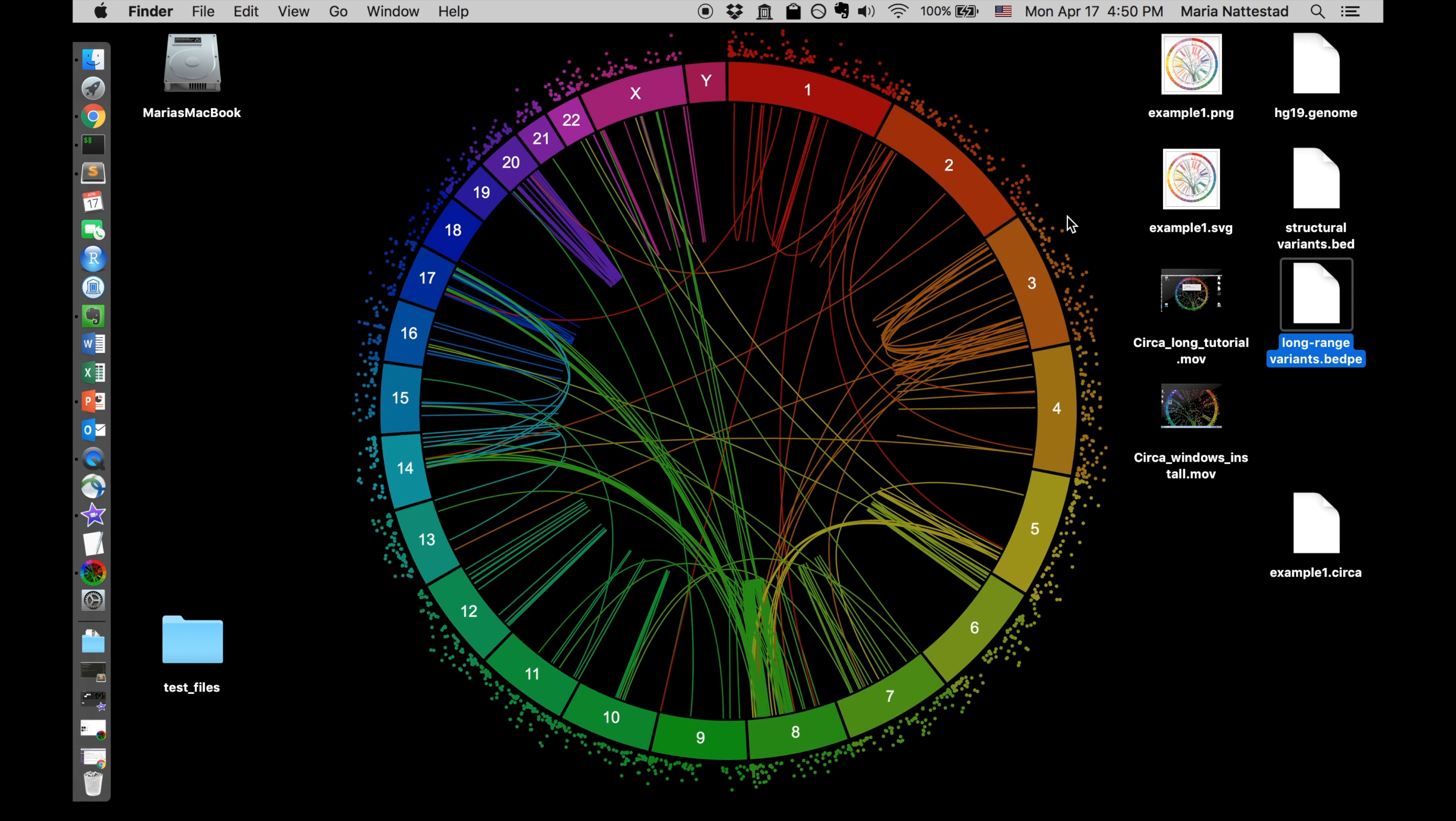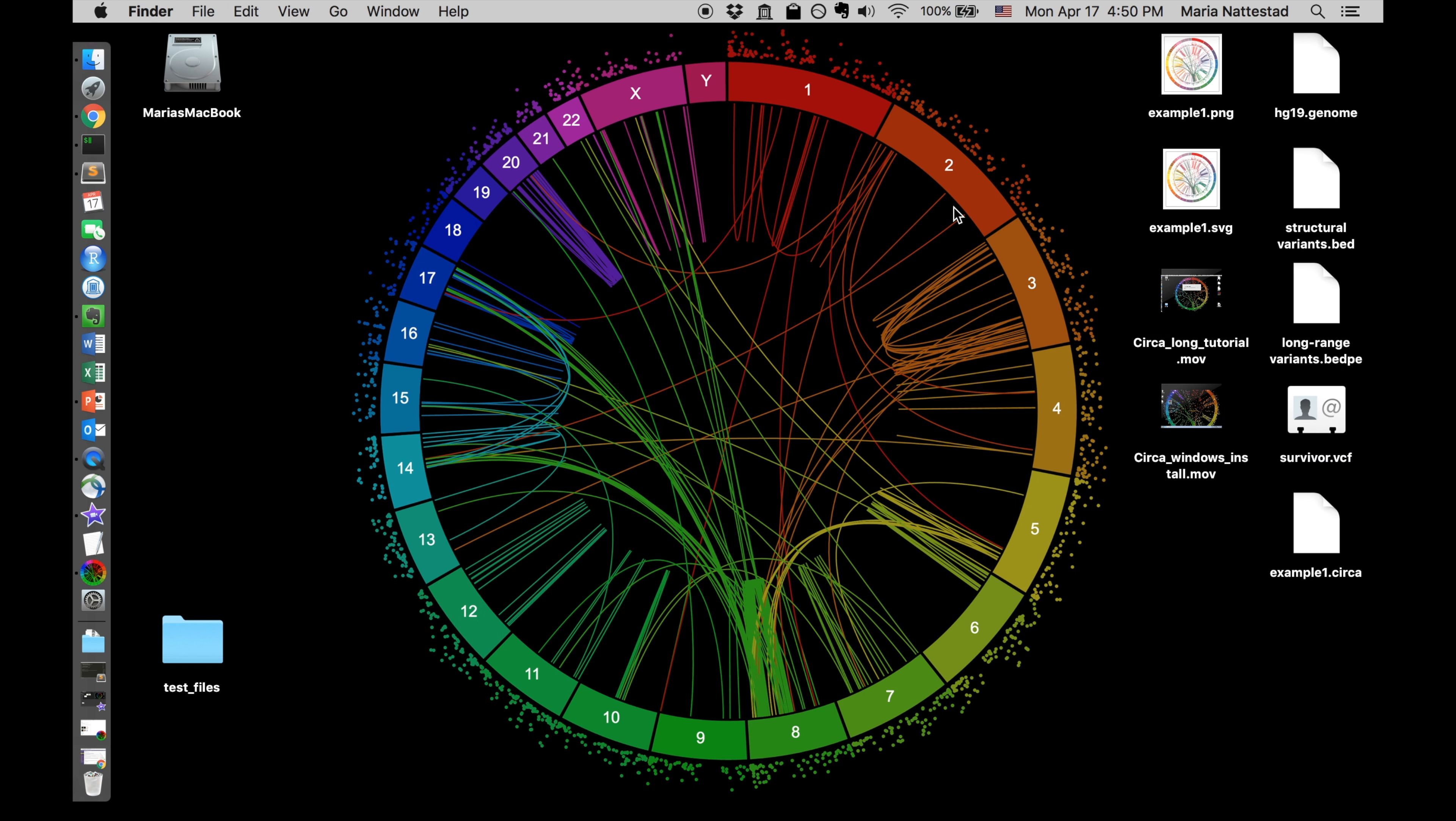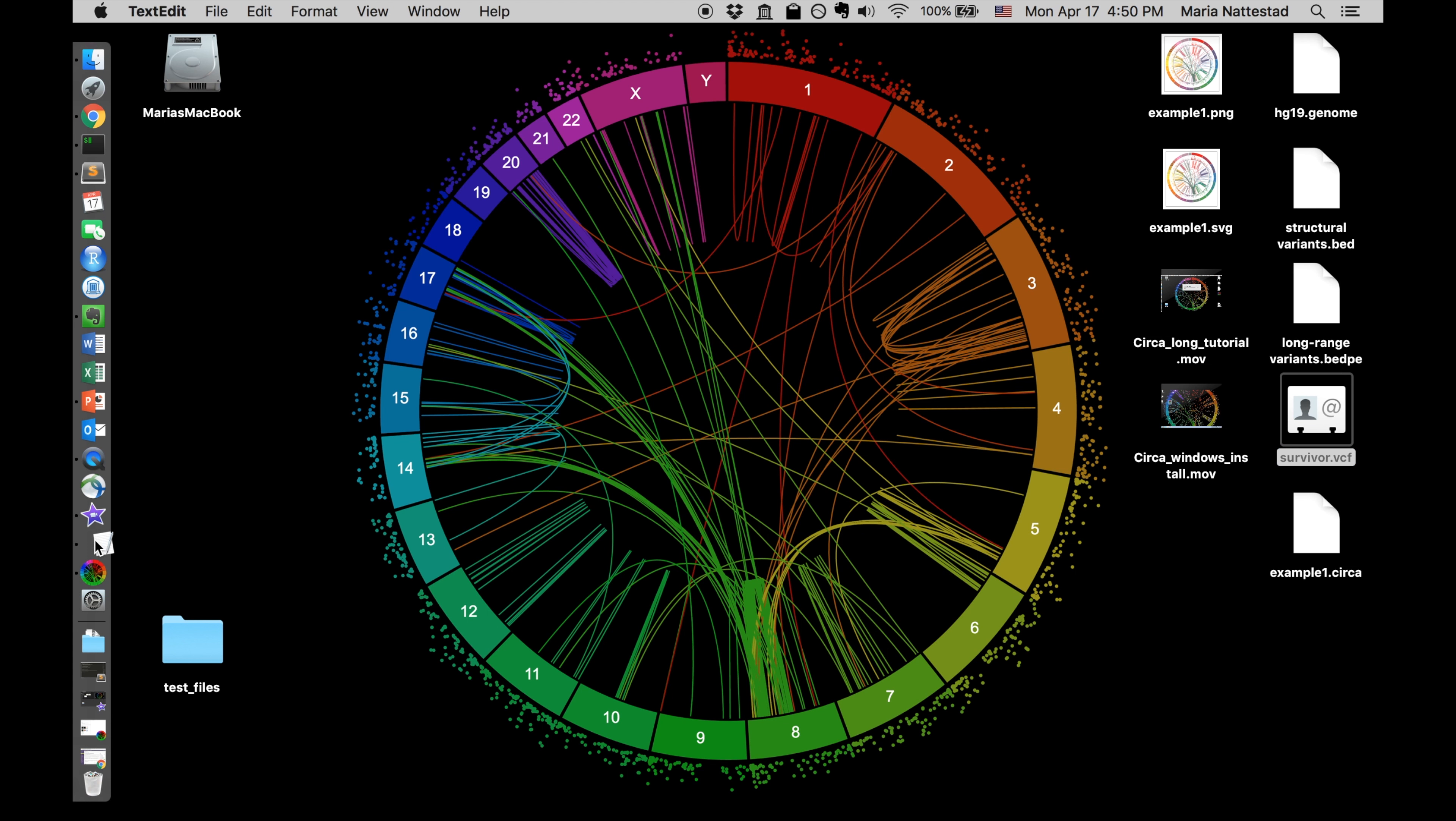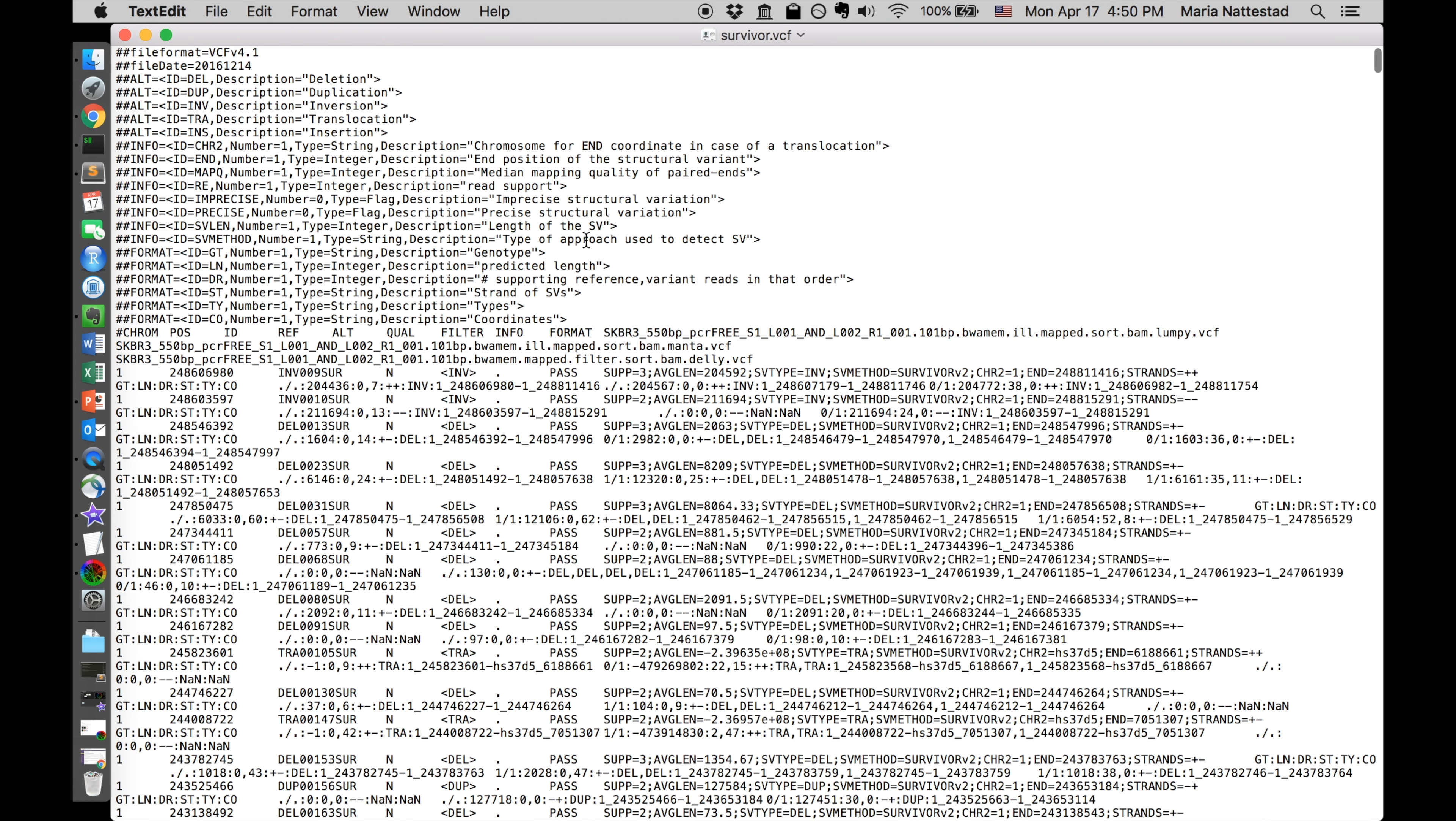I even have support for VCF files. Let me see if I can find one of those. So we also have support for VCF files and these look really funny. You shouldn't double click them because they'll try to add themselves to your address book because VCF is how they do contacts on a Mac for some reason. This is what a VCF file looks like. This is from survivor.